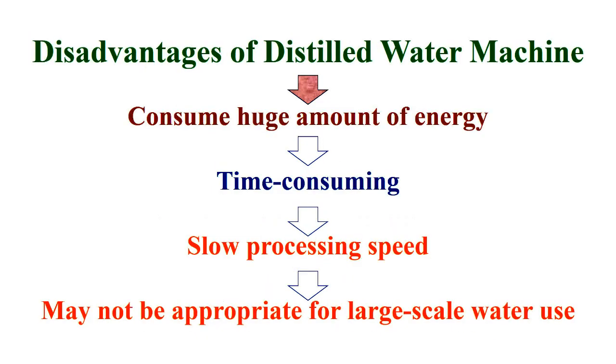On the other hand, the distilled water machine consumes a huge amount of energy and is time consuming due to its slow processing speed, which may not be appropriate for large-scale water use.